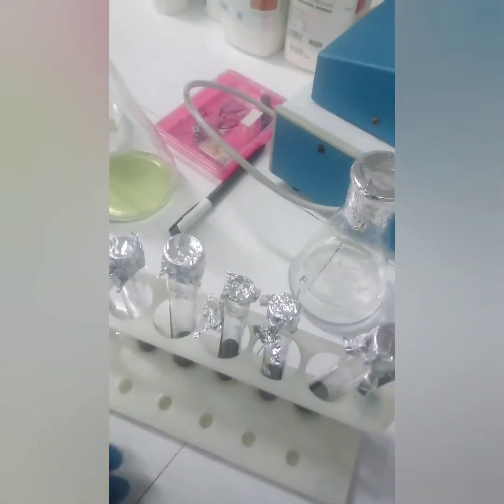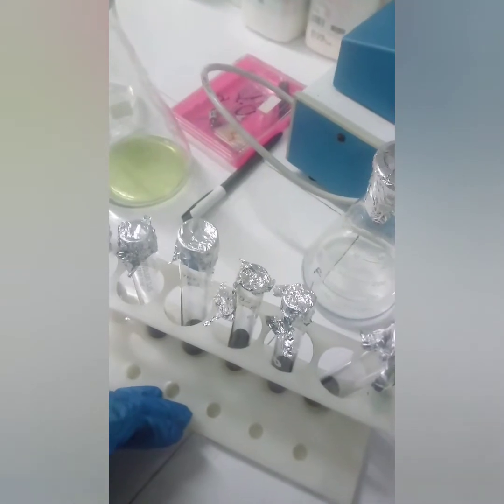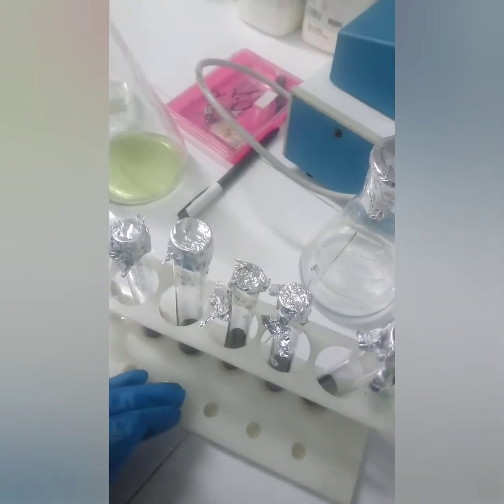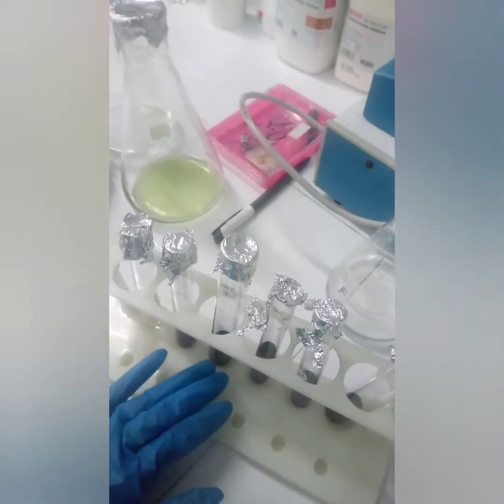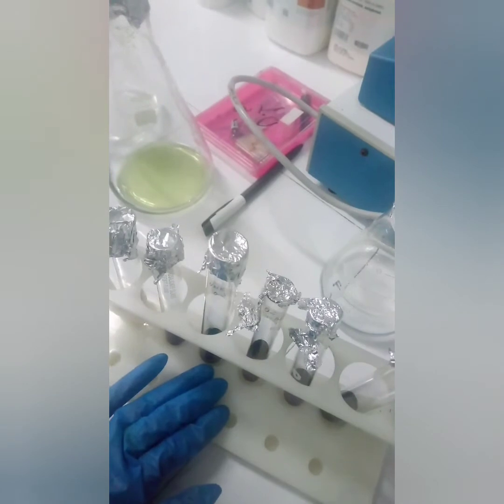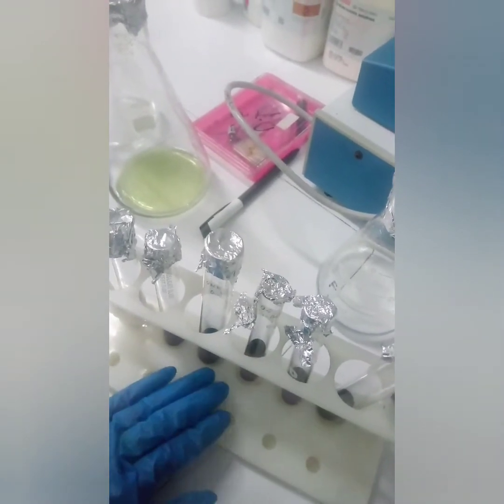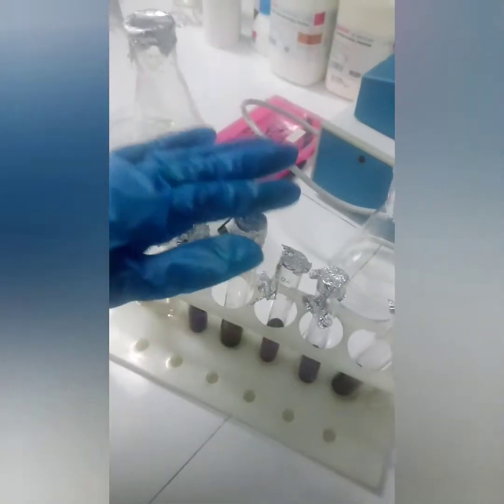When amino acids with a free alpha amino group are treated with excess Ninhydrin, they yield a purple colored product, and under appropriate conditions the color intensity produced is proportional to the amino acid concentration.